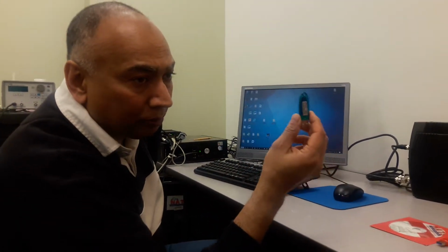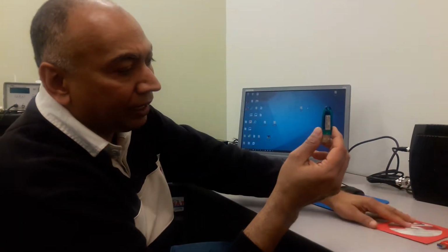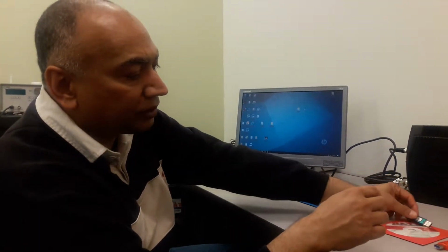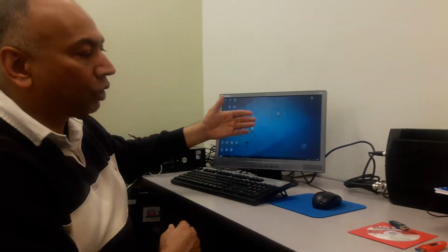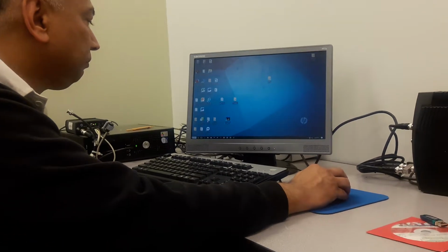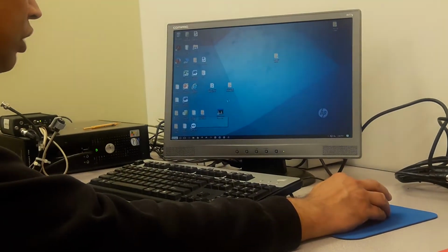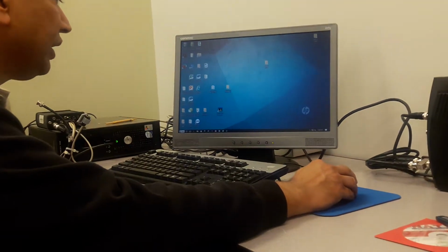Now I'm going to go through the process of installing the software. Again, you have a CD, and in my last video I told you that from the CD you should copy all the files to your desktop and create a desktop icon in here that will allow you to install the software from scratch.